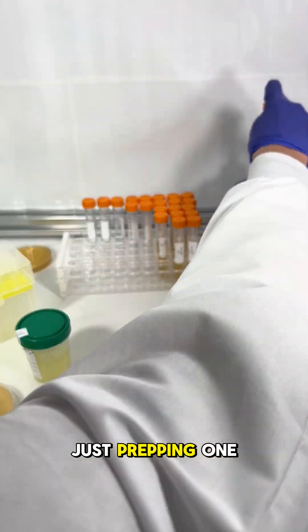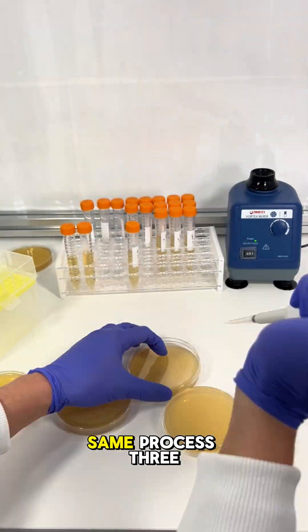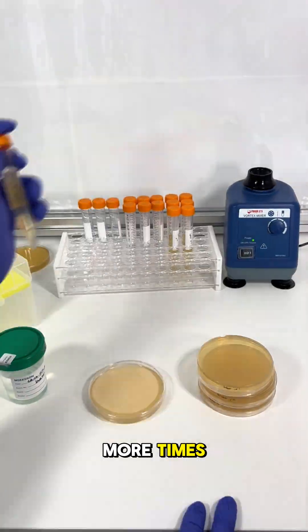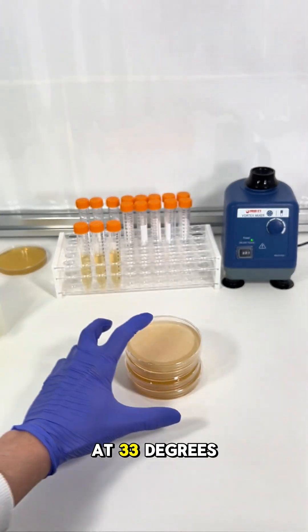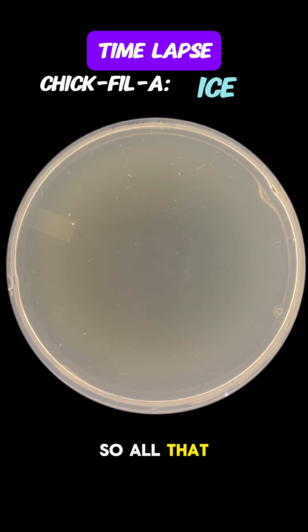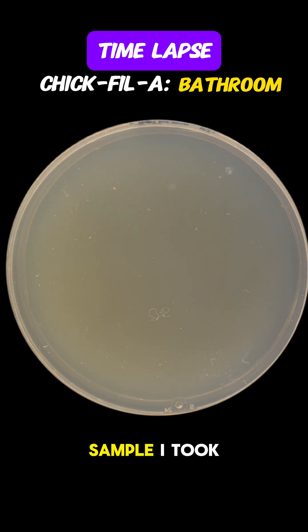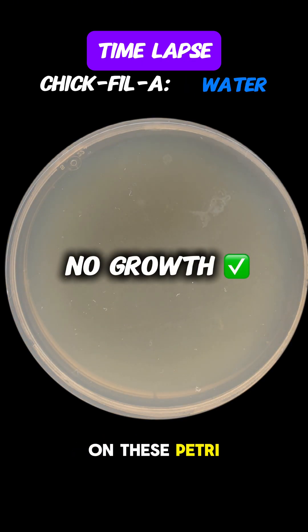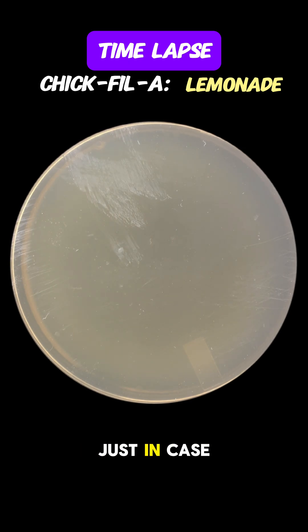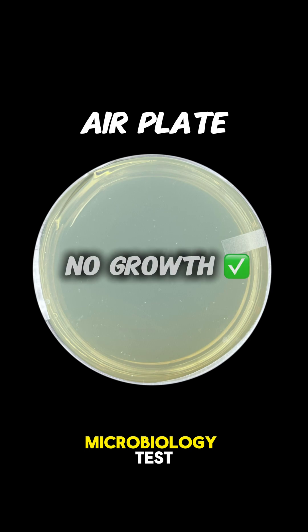That was just prepping one of the four samples from Chick-fil-A, so I repeated the same process three more times. When done, all the plates went into an incubator set at 33 degrees Celsius. After incubation, every single sample had no growth. A lot of the bacteria humans should worry about will grow on these petri dishes, but just in case, I decided to send the samples out for next generation sequencing.